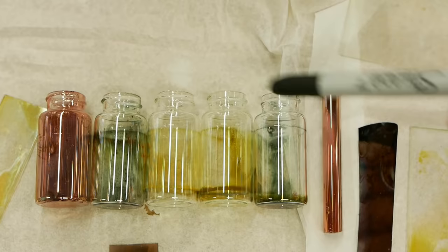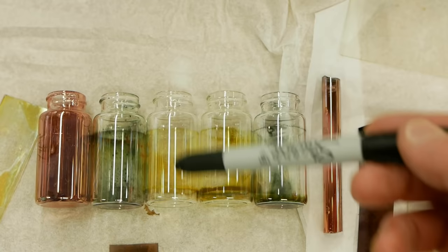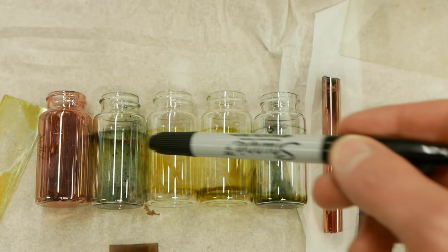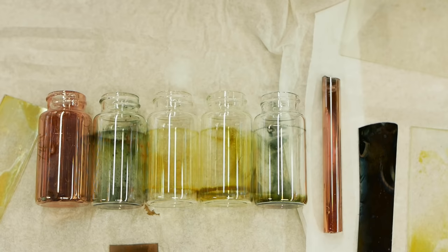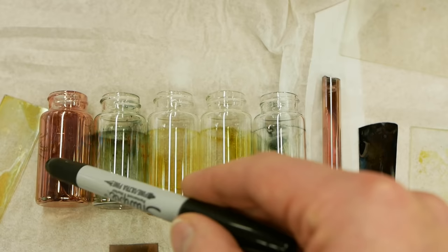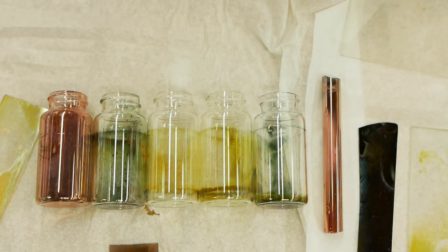I used different flow rates and everything so this was not like I put them in in different orientations in the chamber. I think there's something inherent about the glass that makes them more likely to accept the copper chloride in this region. I have no idea what though. It must have something to do with how these bottles are manufactured. But it also makes me think that this whole ALD process is super surface sensitive. It may work on certain surfaces silicon dioxide pure quartz might be fine but certain types of glass may have too many ions in it or the surface just doesn't have enough uniformity to work with this process. So again it's like one of these things where you read on Wikipedia oh ALD is perfect it makes this perfect atomic coating but then when you get down to it it's like well it only works on certain surfaces.